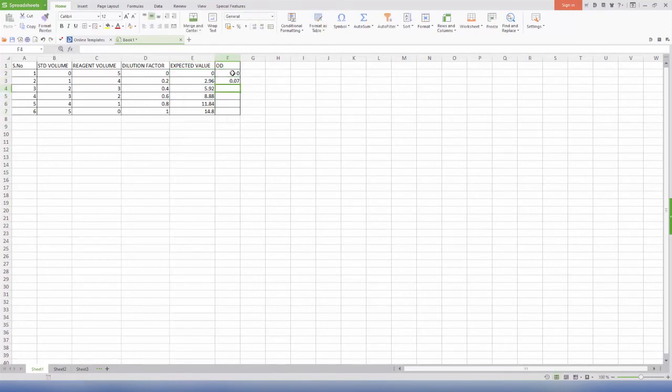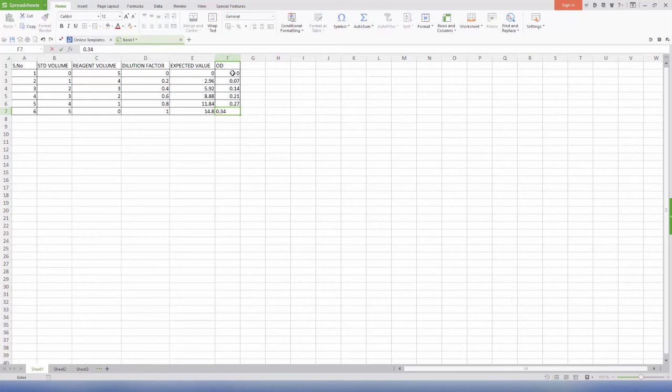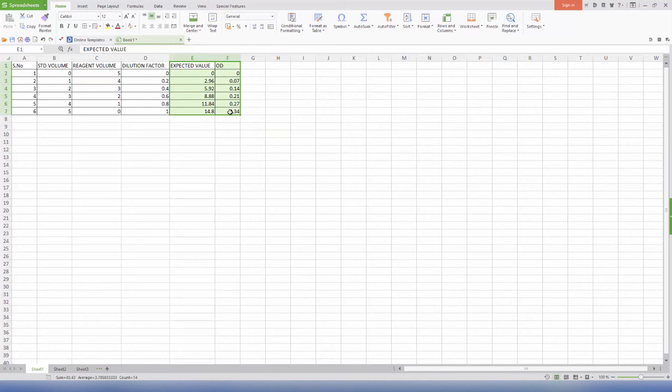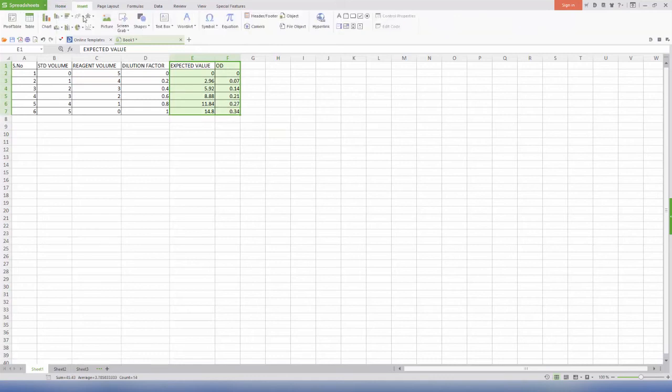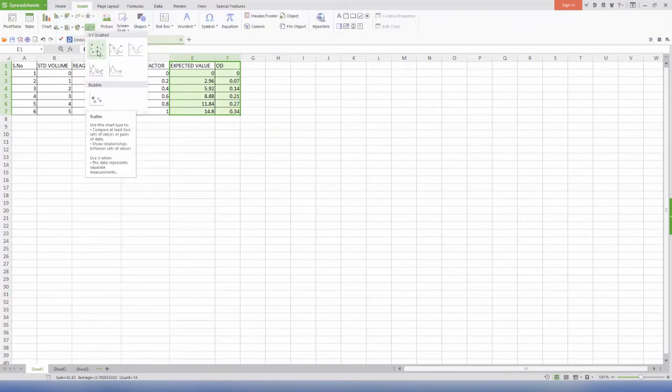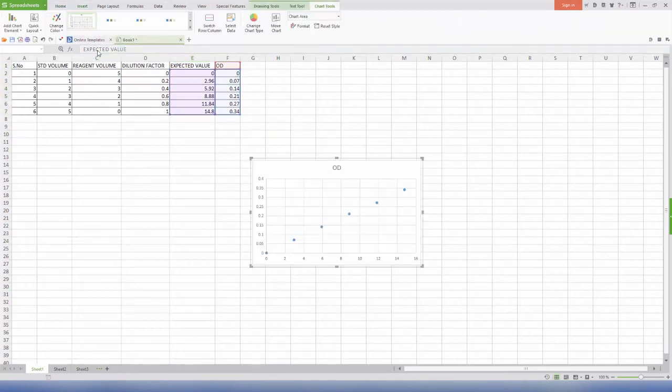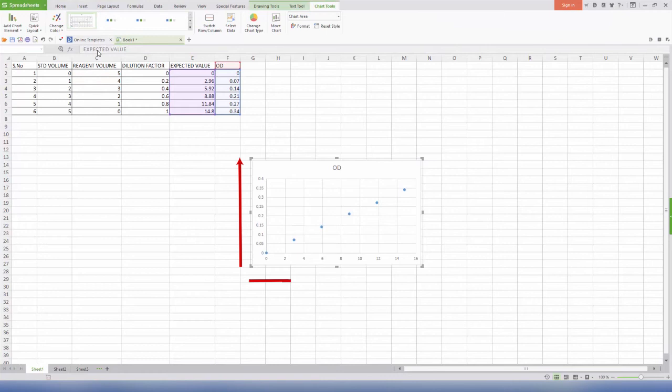Now enter the ODs we have used to prepare the manual graph. Select columns E and F along with headings, go to insert, go to scatter, and select a graph.